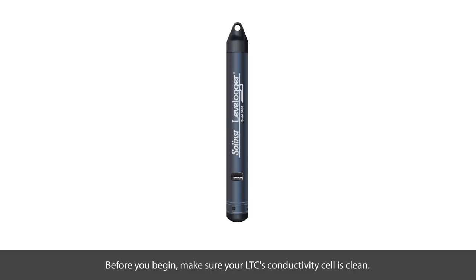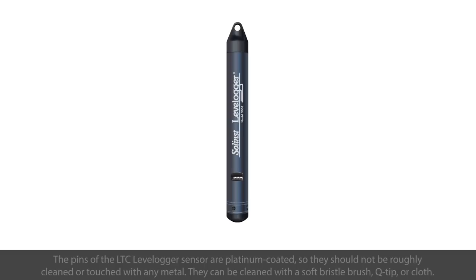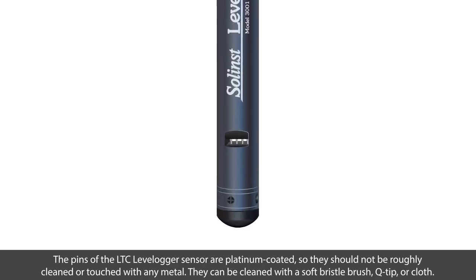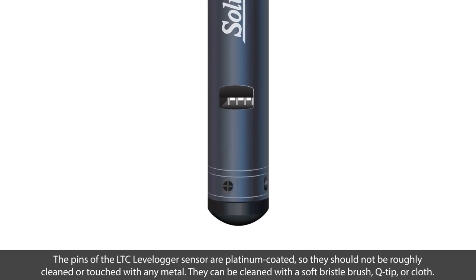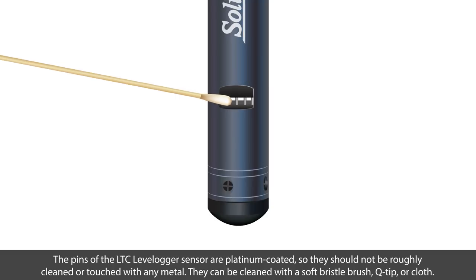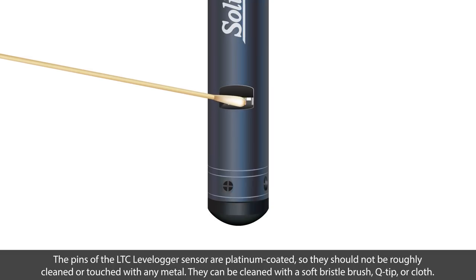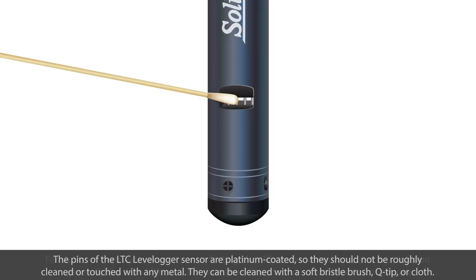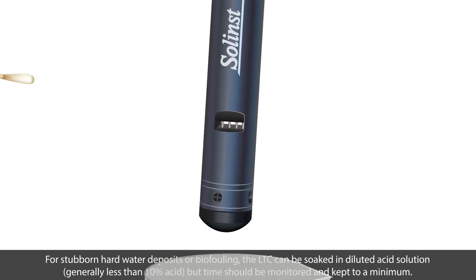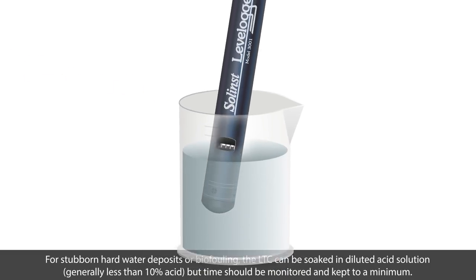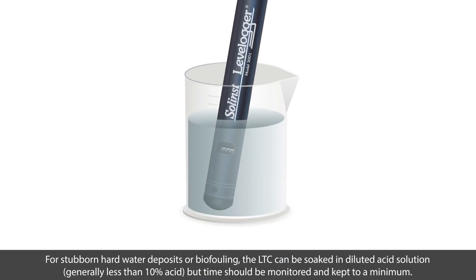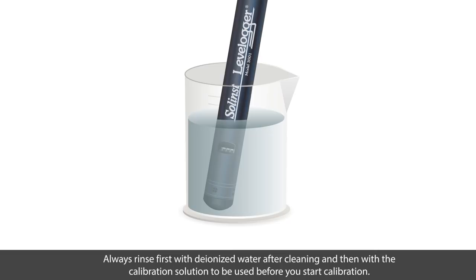Before you begin, make sure your LTC's conductivity cell is clean. The pins on the LTC level logger sensor are platinum coated, so they should not be roughly cleaned or touched with any metal. They can be cleaned with a soft bristle brush, q-tip, or cloth. For stubborn hard water deposits or biofouling, the LTC can be soaked in diluted acid solution, generally less than 10 percent acid. However, soaking time should be monitored and kept to a minimum.